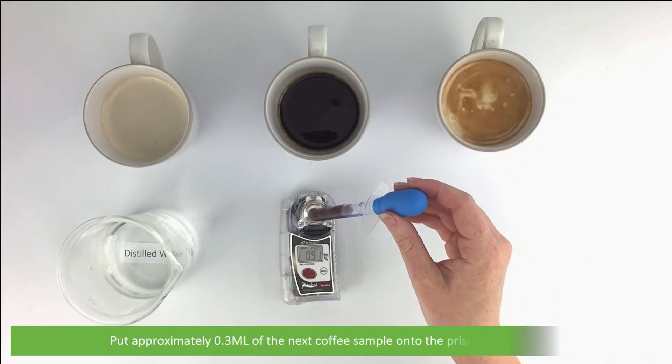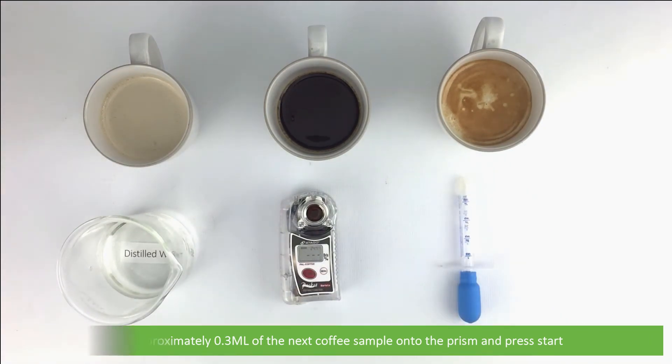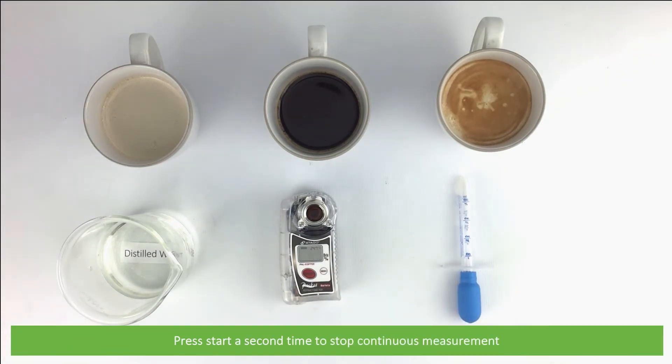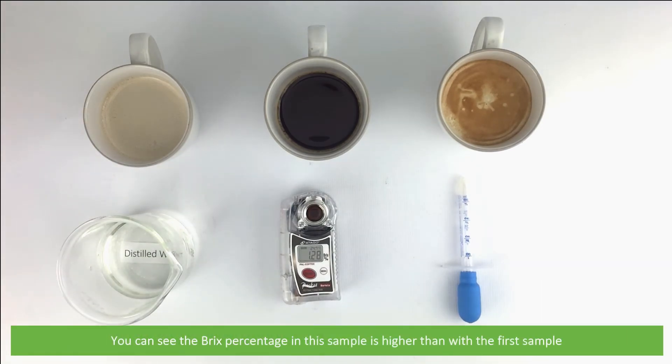Put approximately 0.3 mls of the next coffee sample onto the prism, then press start. Press start a second time to stop continuous measurement. You can see the Brix percentage in this sample is higher than with the first sample.